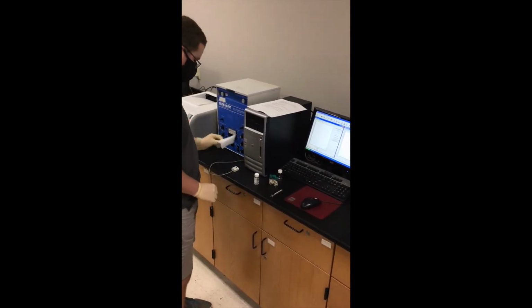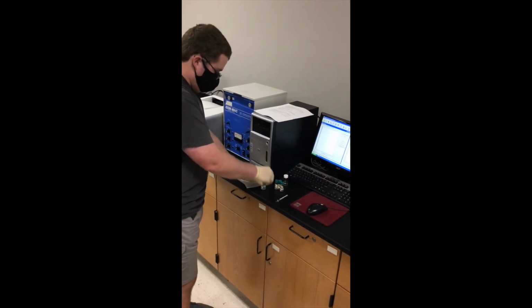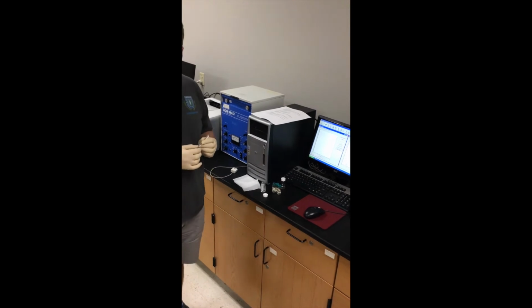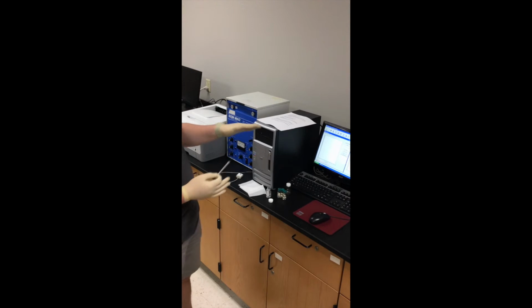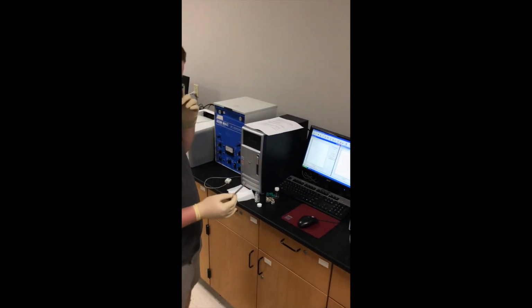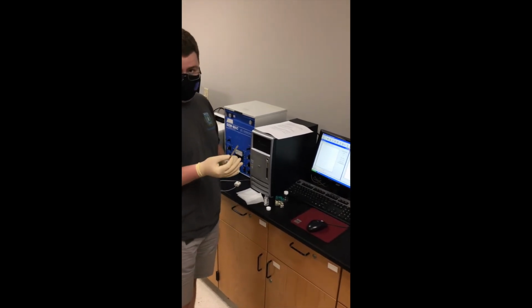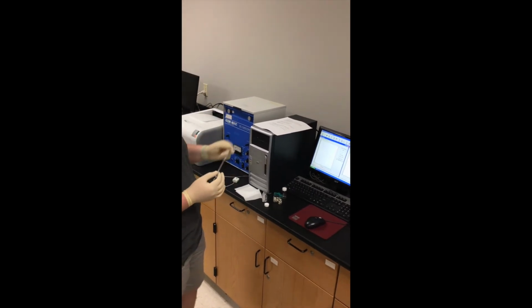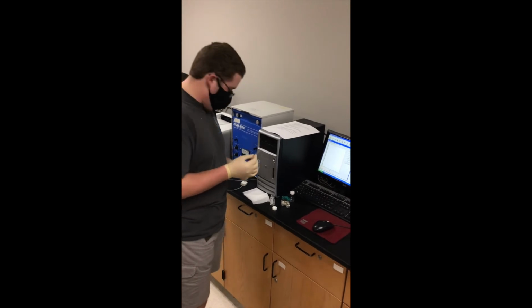So I've got my stuff ready to go. Supposing I wanted to inject a sample into here, in this case I'm working with hexane, so we've got plenty to work with. One of the biggest problems we see with the GCs is that we put stuff in there, at least we think we do, and then the GC shows nothing when it comes out. It just has a flat baseline, and then everybody freaks out. One of the first things we suspect is that these microsyringes are no good anymore. Either the tip has been clogged by a piece of rubber from the septum on the inside of the GC, or maybe the needle is slightly bent, and so it's not actually picking up any volume.